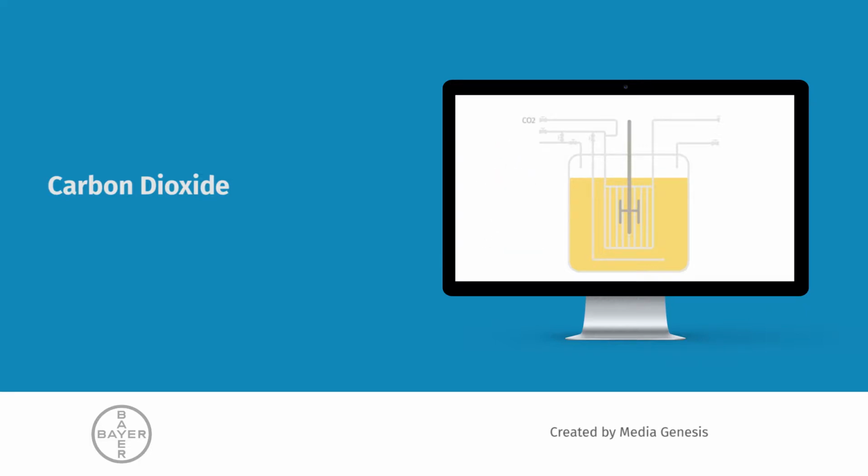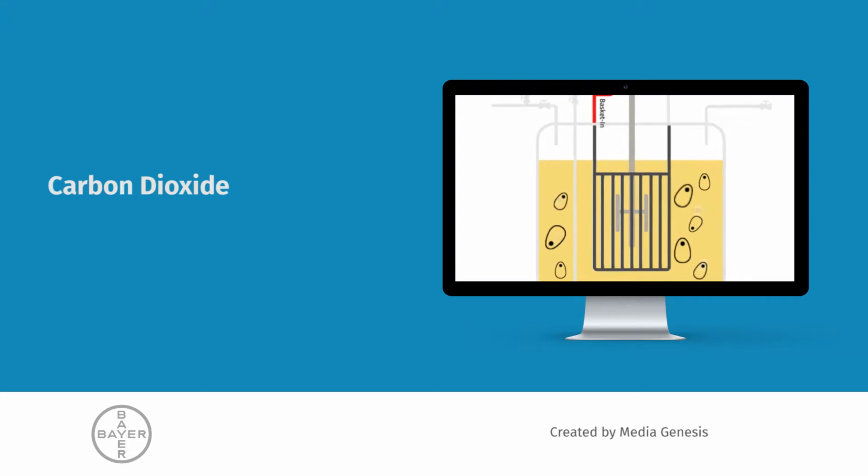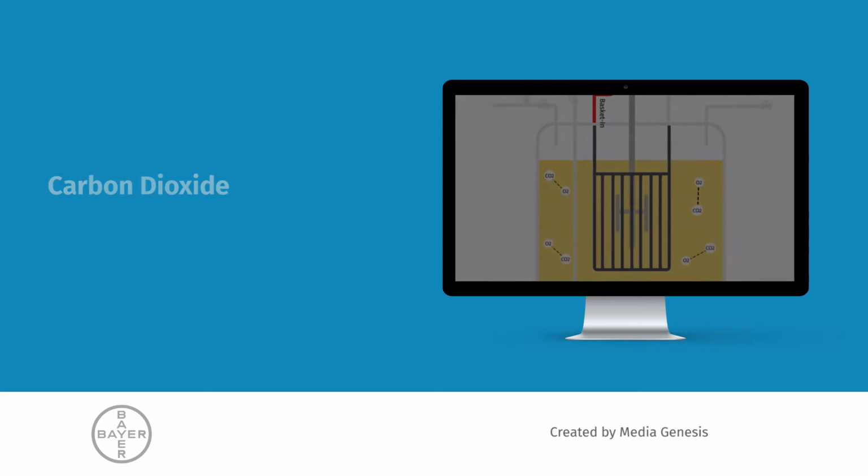Carbon dioxide is added to the culture through the basket at initial accumulation stages to maintain an optimal concentration in the culture. Once cells grow beyond the accumulation stage, they begin to excrete more carbon dioxide due to higher cellular metabolism. This increases the concentration of carbon dioxide in the culture. Carbon dioxide in the culture is exchanged with oxygen in the bubbles.